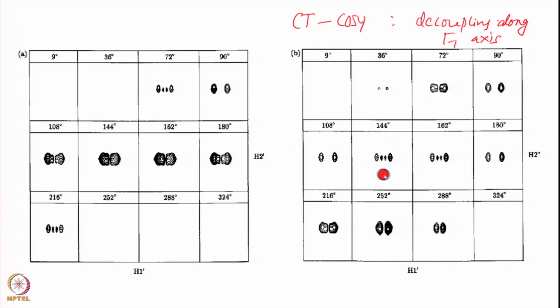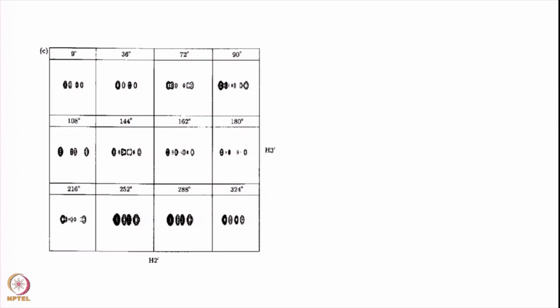Although there is some cancellation in the middle in this area, that is why the central peaks have lower intensity, nonetheless you can calculate, measure the separations, and get an idea as to what they will be. They may not be precise, but you will get the precise values after the simulations.